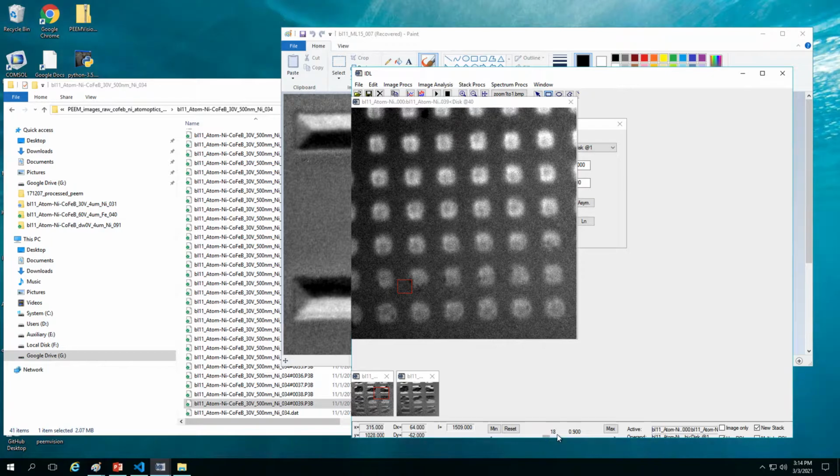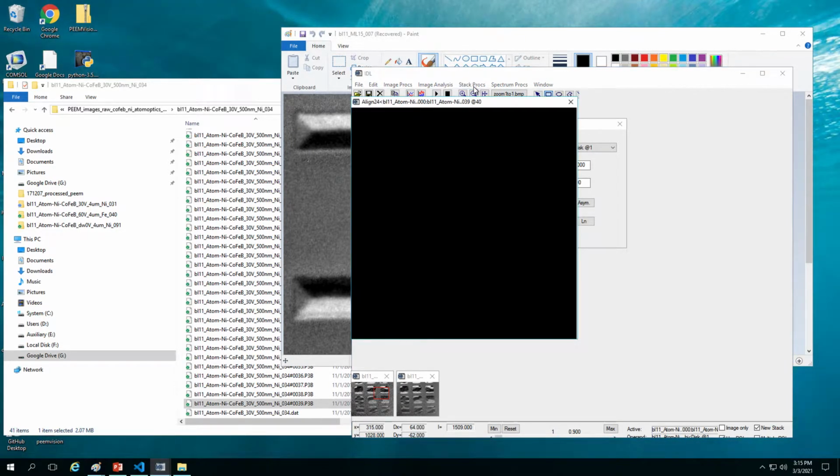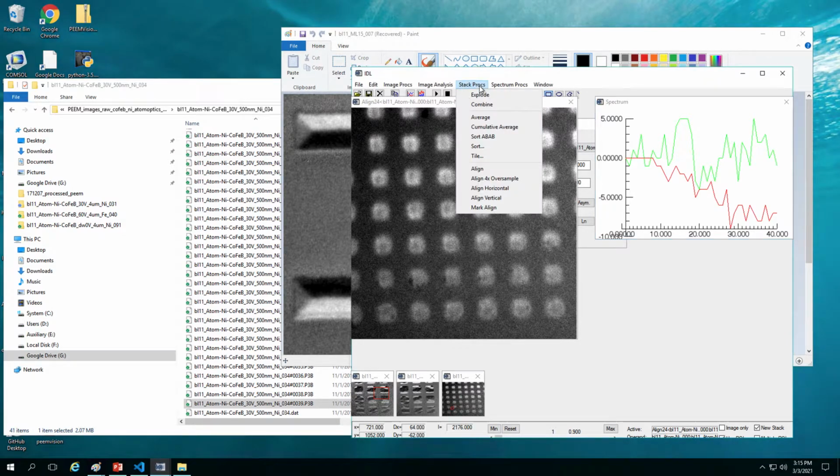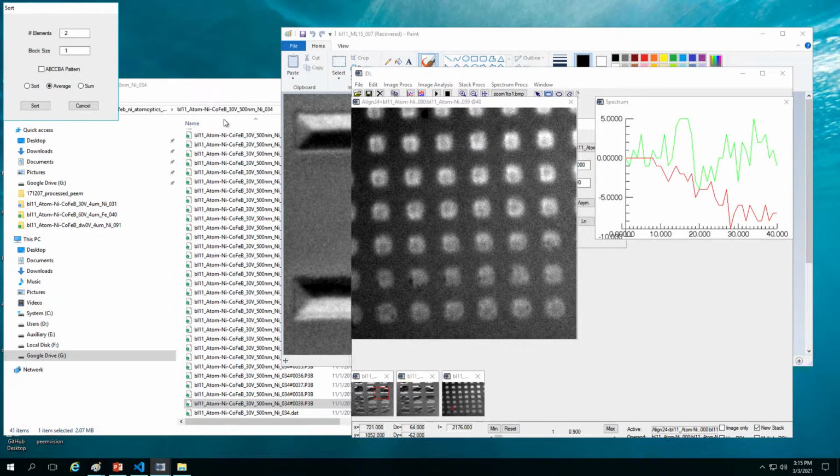Yeah, see, it's kind of slow here, but it's progressing. Yeah, the alignment didn't go that well, but let's see how it goes. Yeah, if you want to redo it, you just re-import all the files and repeat. Okay. So now our block size is 20.